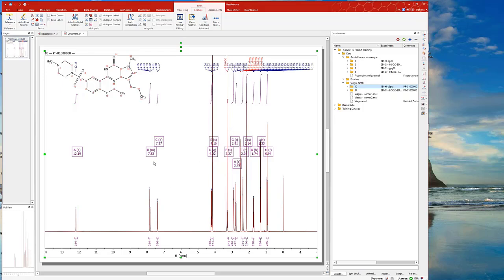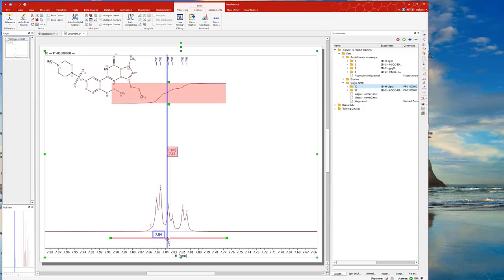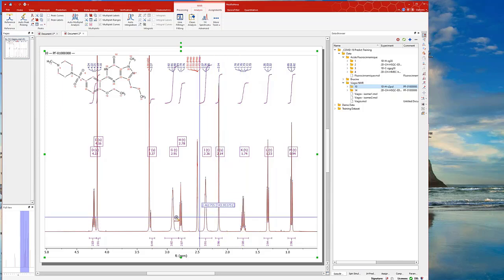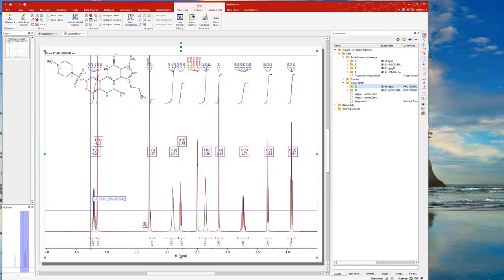So now I have the experimental spectrum analyzed with picking, multiplet analysis, and integration. You can see that. I can zoom in to take a closer look. For example, here, apparently this is like two very close multiplets taken as one. So I can just hover the cursor here, click and drag, and split it. Right. So I know this one is another one, right? For this spectrum, the other one seems to be okay. Apparently this methyl group, CH2, and another methyl group, and solvent is recognized. So a water peak is recognized. Yeah. Some impurities there.